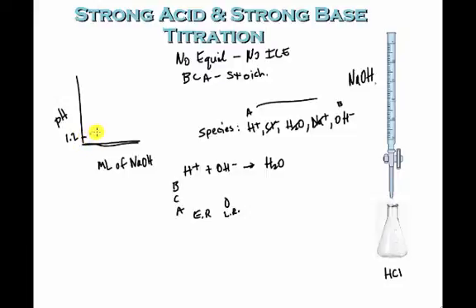All right, I'm going to keep doing this and keep doing this, and eventually more and more of the hydroxide is going to get added to this. I'm going to have less and less acid. So eventually I'm going to get to a point where this no longer is my excess reactant, but they'll both be the limiting reactant. That's a special point.